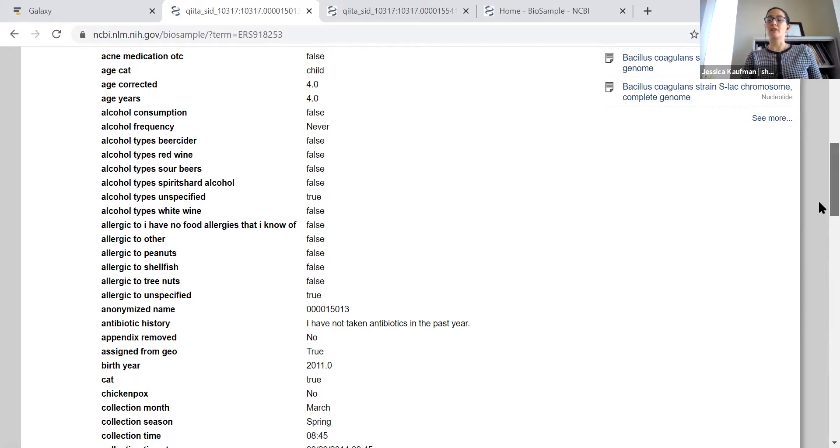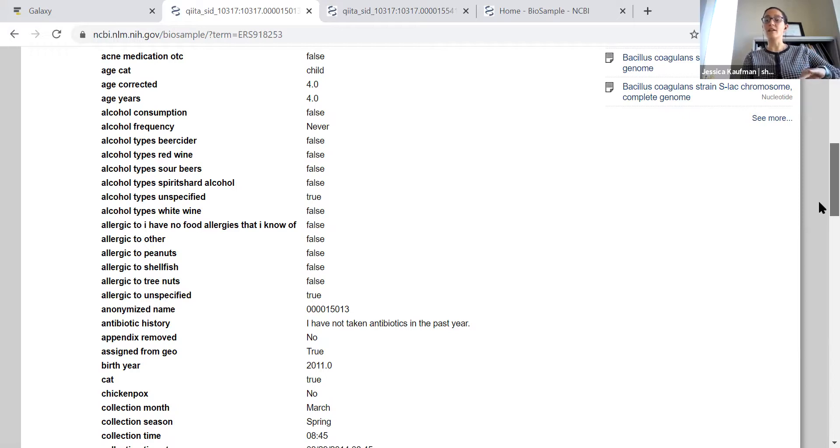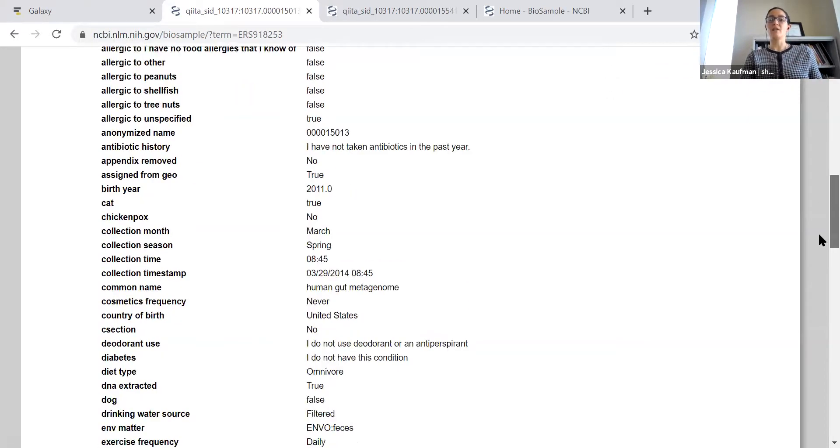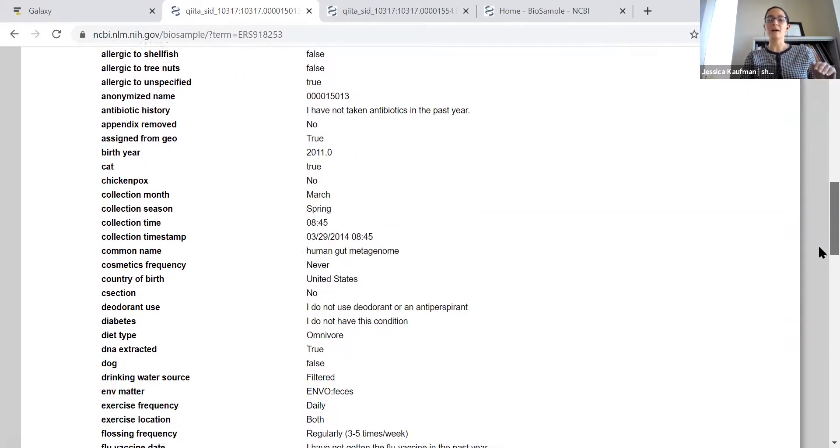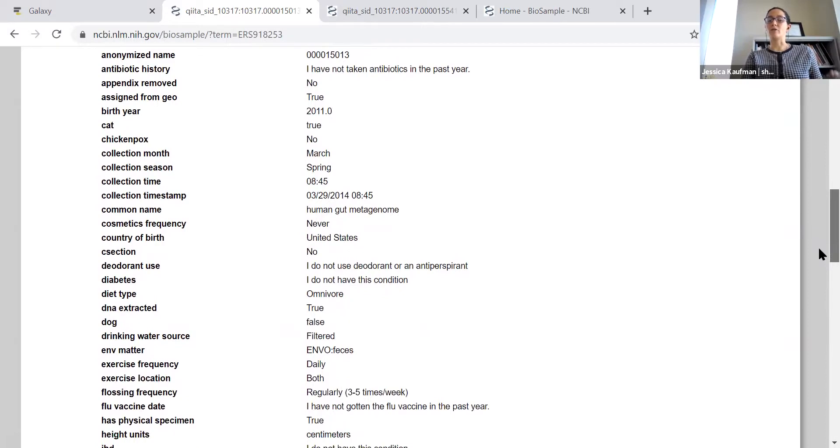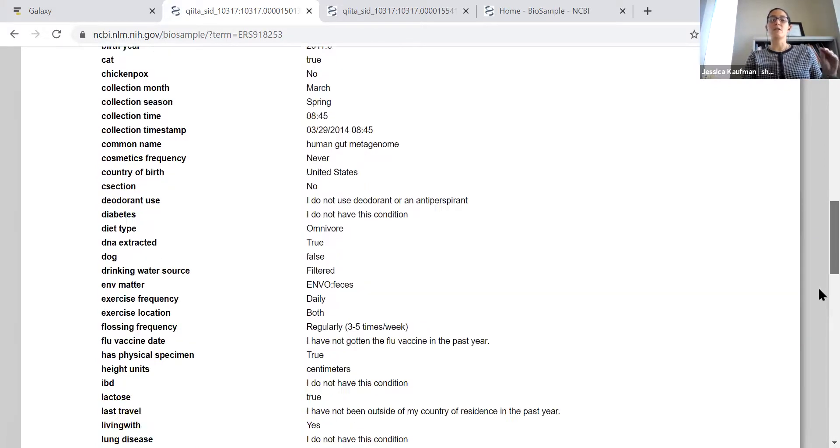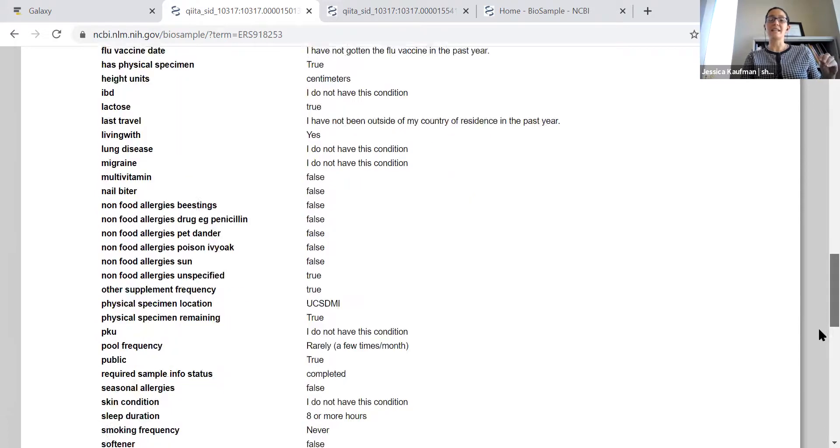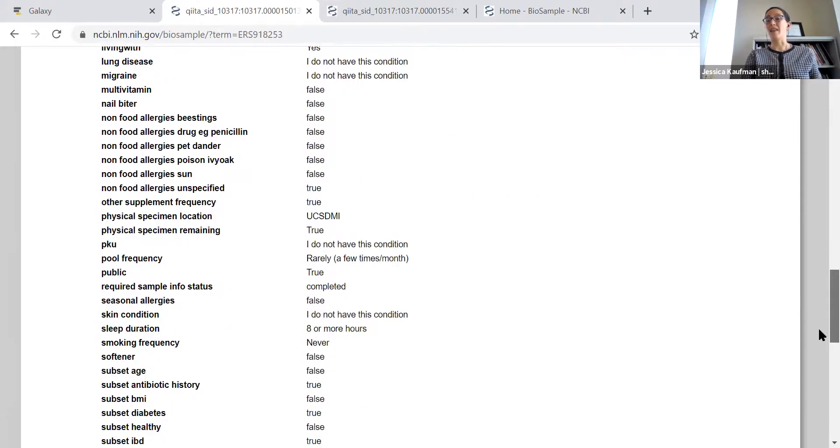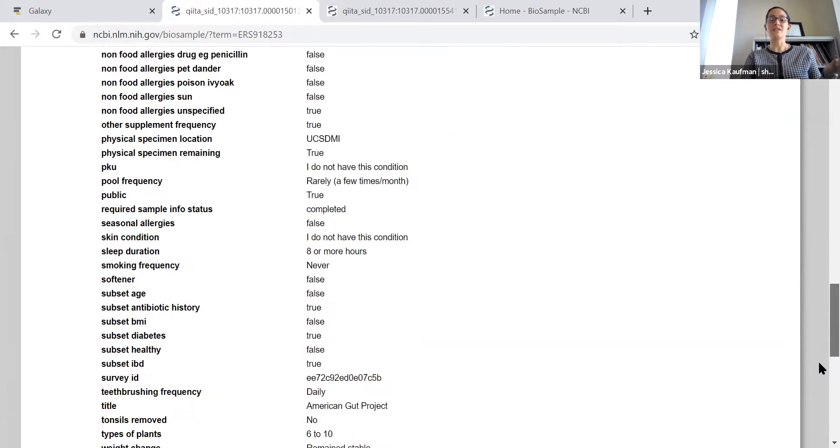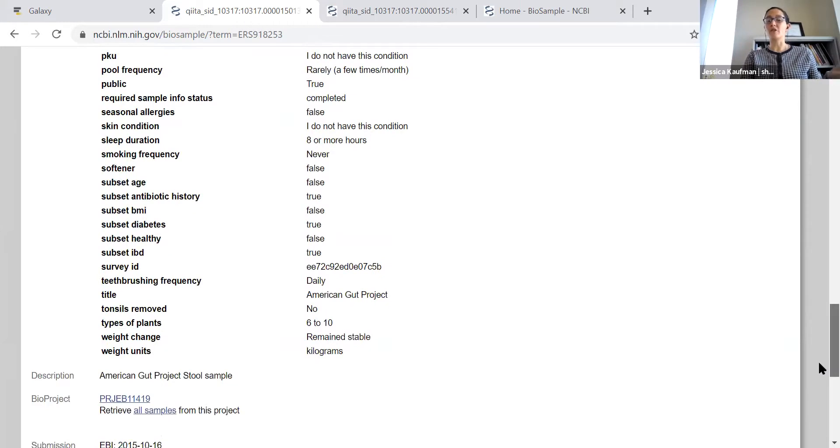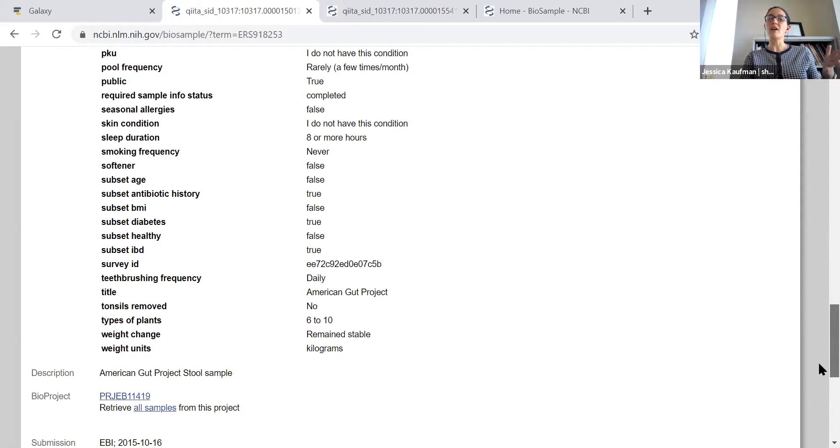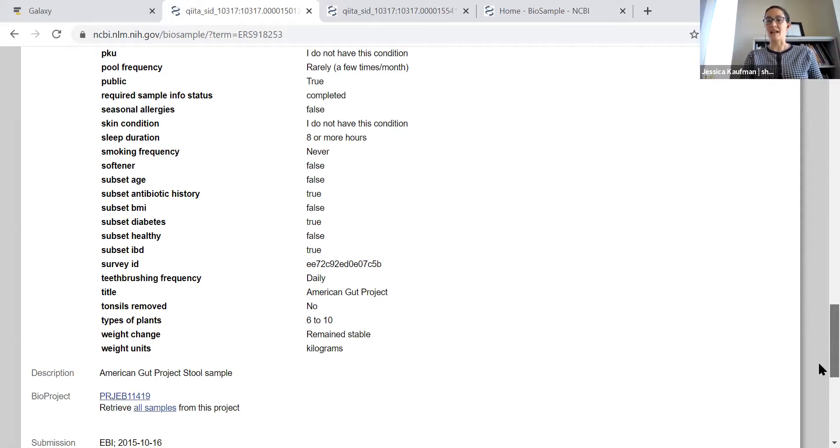You can look if an individual is allergic to peanuts or not. You can see here this person is allergic to peanuts false, so they don't have a peanut allergy. You could look at if they've had chicken pox, their drinking water source, whether they've had flu vaccines, if they have a dog, if they have migraines. There's so many questions. Your first part of the project is just picking which of these variables you would like to examine.